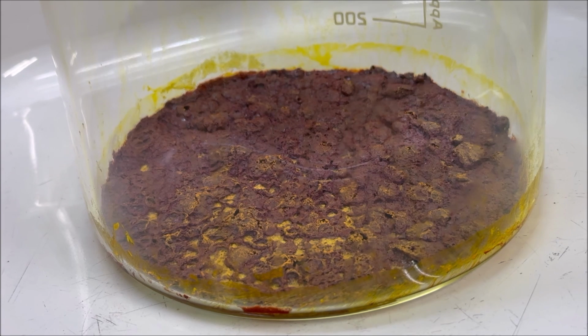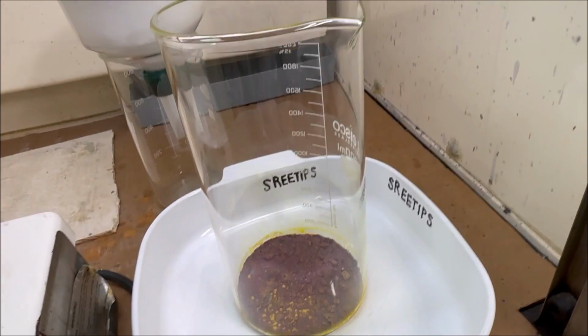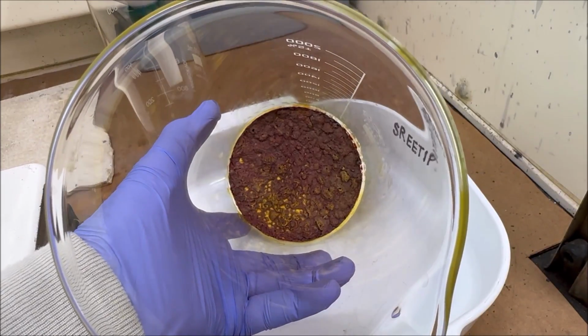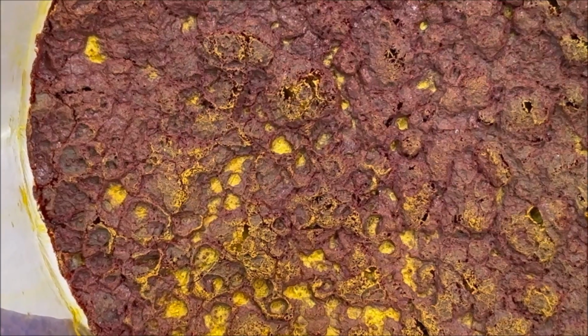Folks have asked me what would happen if we went down to dryness. Now we know it forms this red material. This is the chloroauric acid crystals, I believe. I've allowed this to cool down to room temperature. If you look down in there, it looks kind of red. It's got a red color to it.